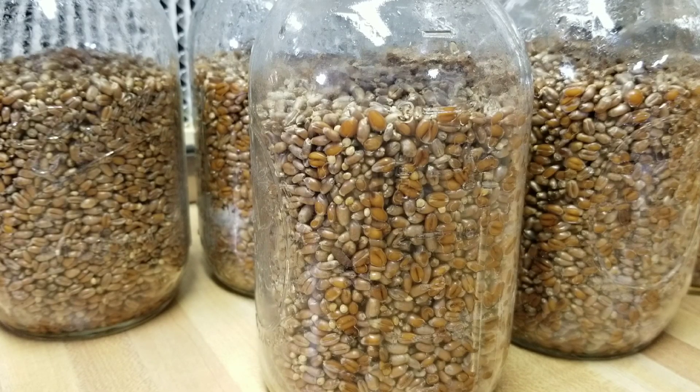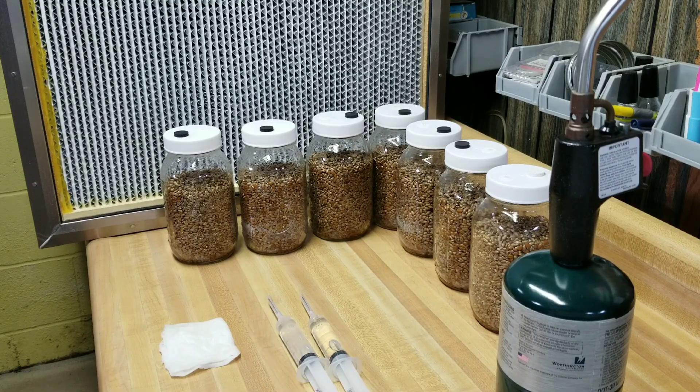This is what they're gonna look like - totally normal. Now I'm gonna do the liquid culture jars first: squirt four of these quart jars up with about five cc's of liquid culture each, give them a shake, and move them into incubation. I'll talk about that more at that point.